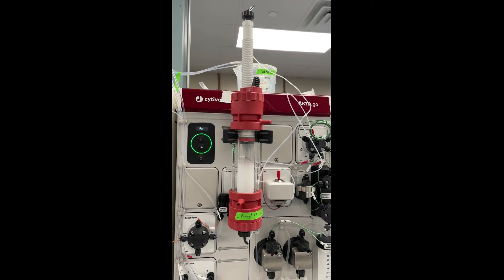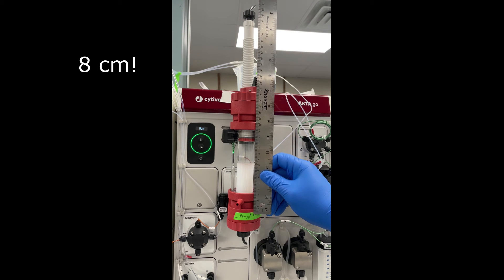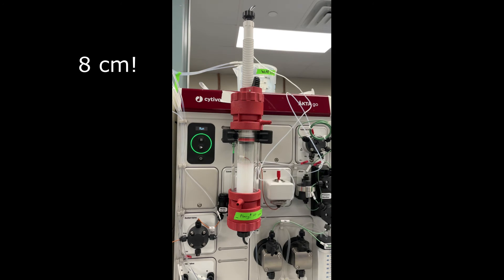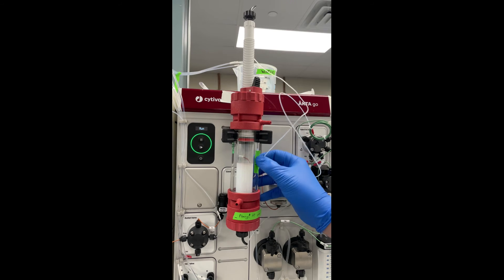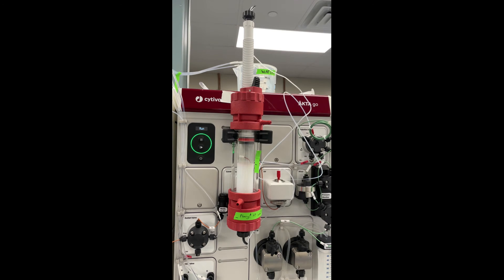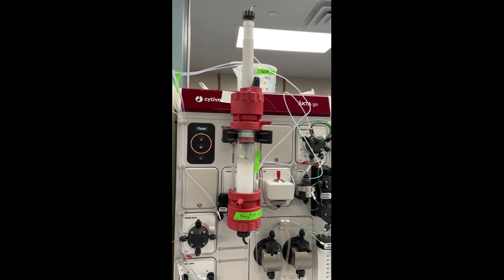Once the resin bed is settled, it's time to lower the adapter. The first thing we're going to do is measure the settle bed height, and we'll find that I actually got it right the first time, so that's awesome. Then we'll mark where the resin bed settled to. This way we'll know where to lower the adapter to after we hit the pause button on the chromatography system.